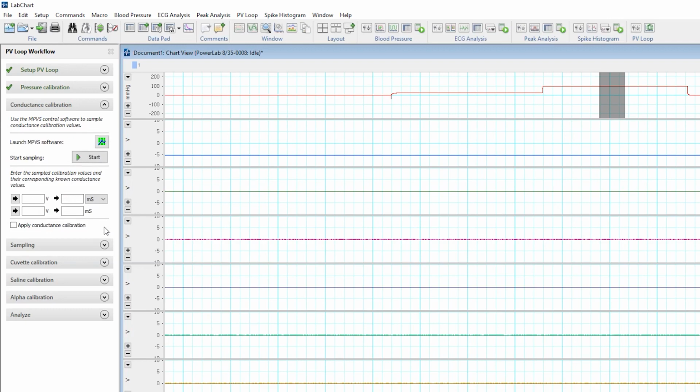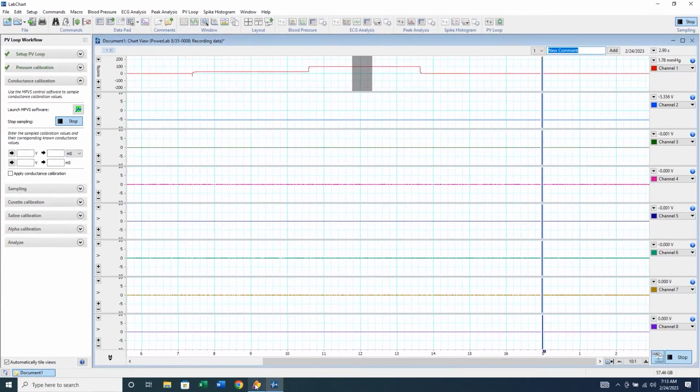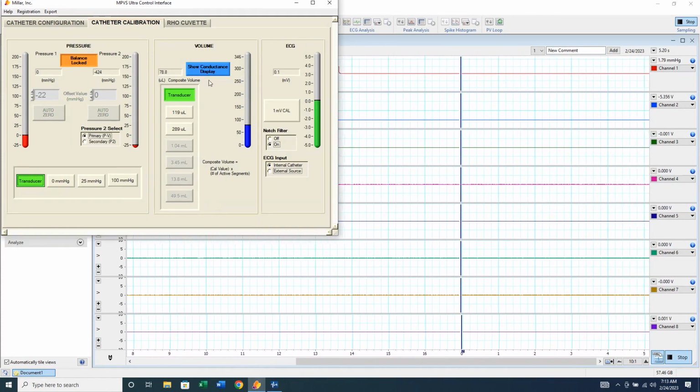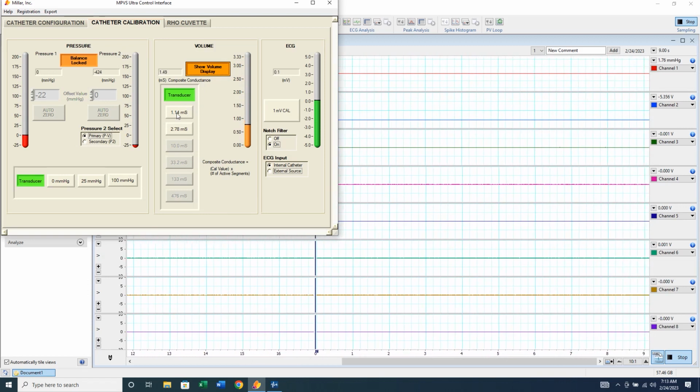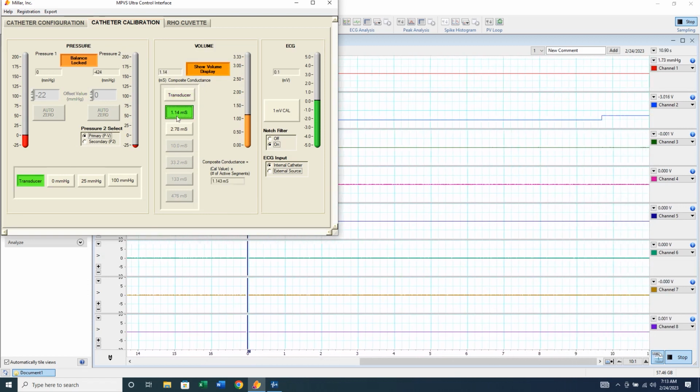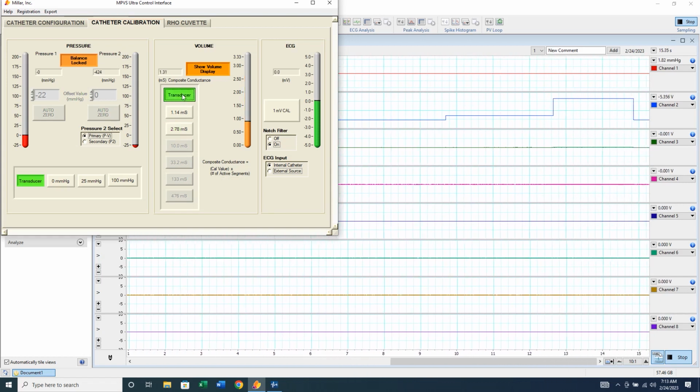Select Conductance Calibration and again start sampling. Move over to the control interface and click on the blue button to display conductance values. The button is now orange. As with the pressure calibration, click on 1.14 millisiemens and 2.78 millisiemens and then back to transducer.